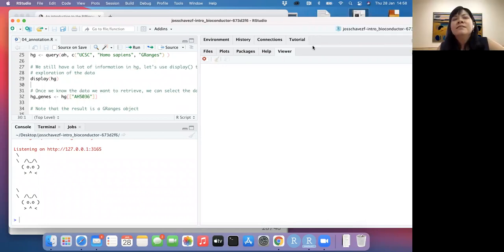What you could do in that case is that separately, you have a list with all the species names and the property of it, whether it is mammal or bacteria or virus. And what you can certainly do is to provide a vector here.